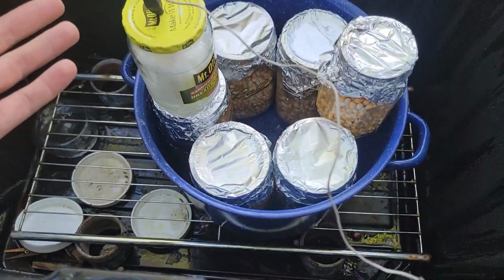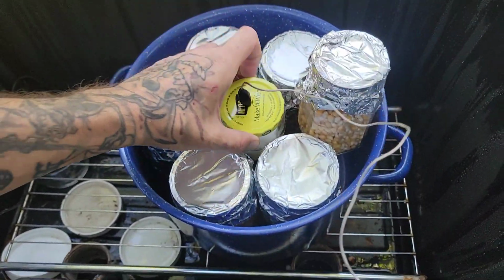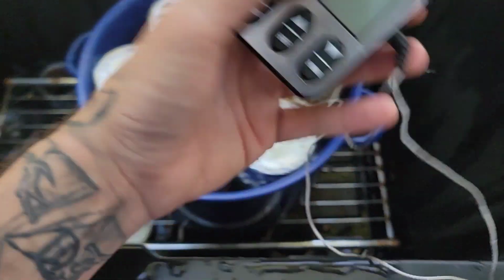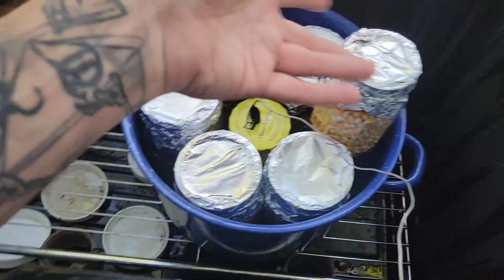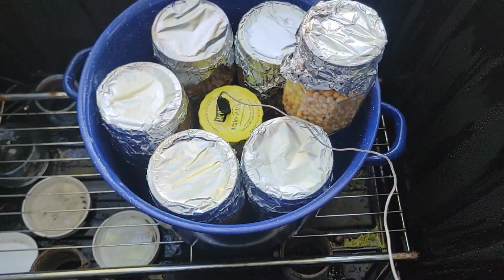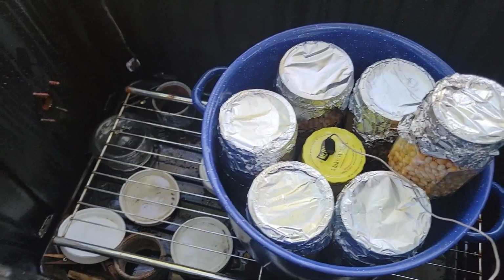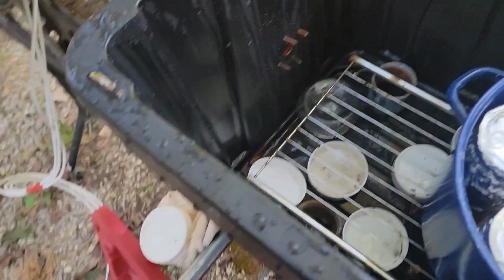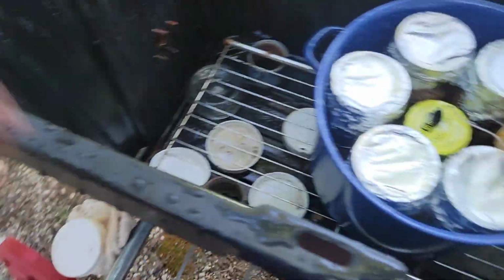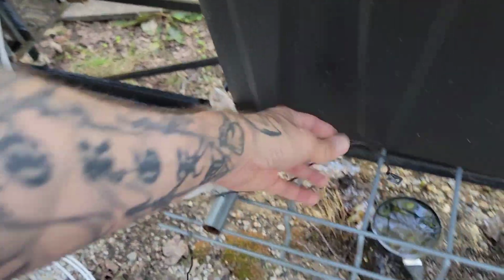Alright, so now we have our grain in here. I have just a paper towel with some water and a temperature probe in there. We'll run that out here just so we can see how hot it gets to. I wouldn't want to put that in my grain, as when I pull it out, I could risk something coming into it. So now the only thing we have to do is take the PID or thermocouple or whatever this thing is called, throw it on the ground. You don't need it right now for what we're about to do, okay? Put the lid on. Got that hanging right there.